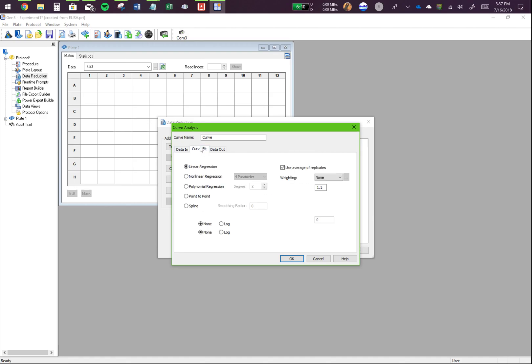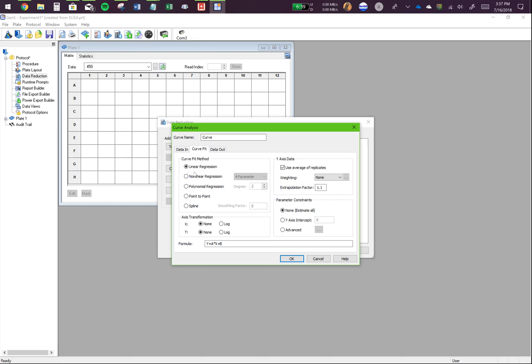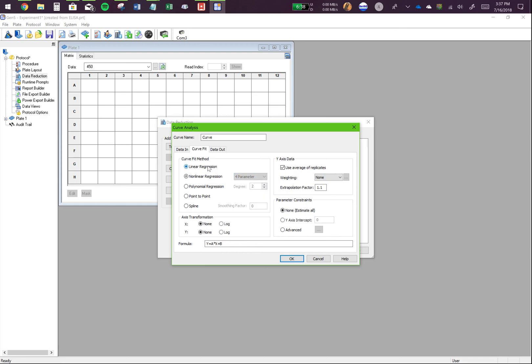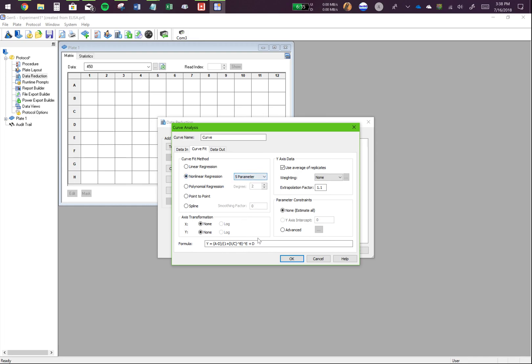Next, you'll click on curve fit. Now, if you know what kind of curve fit works for you, that's the best else you can try different curve fits and see which one gives you the best R square value. So for now, let's just make it a linear regression. And you have the formula right here that this is the formula that the program will use to interpolate the unknowns and for different regression values, there are different formulas.